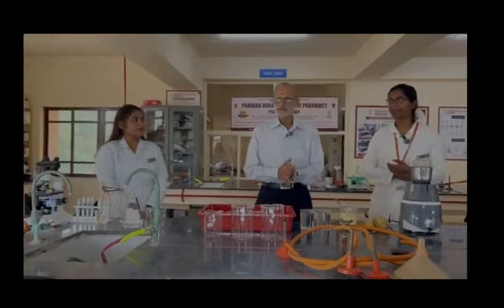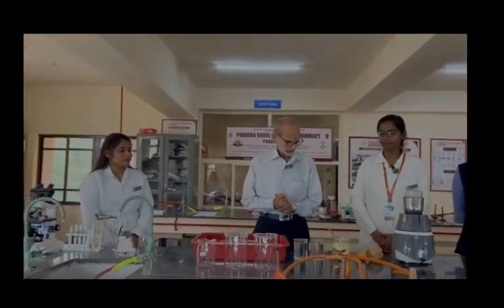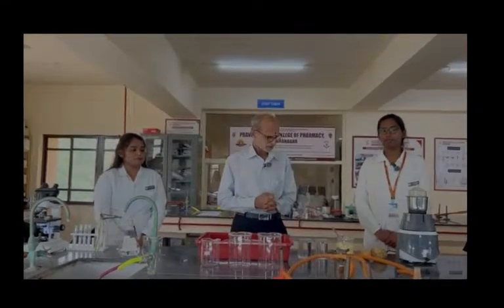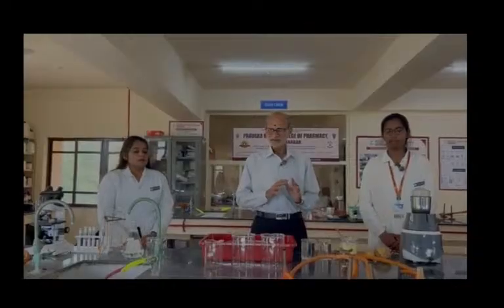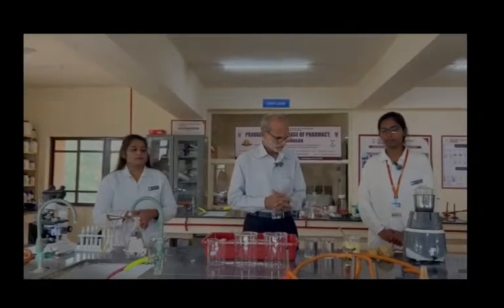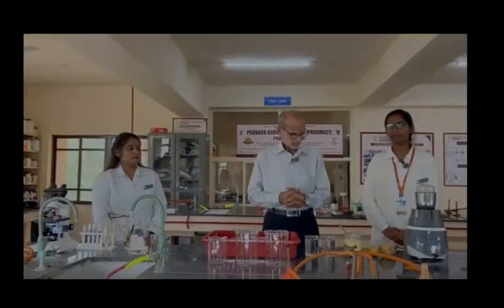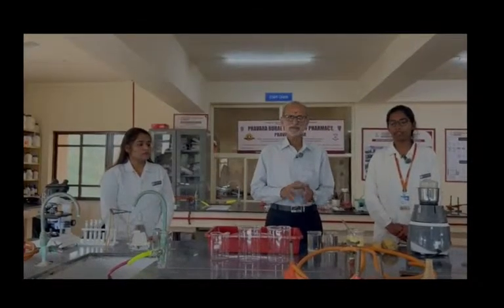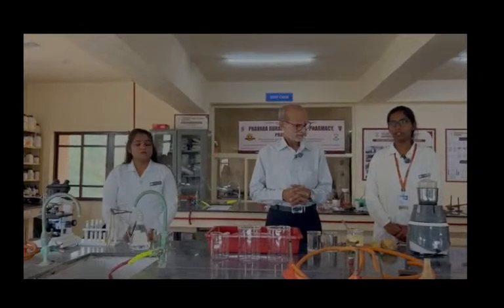We are going to begin with the very first experiment, that is separation of starch from potato. Let me give some idea about the starch. Starch is extensively used in the industry, whether it is food industry, pharmaceutical industry, or textile industry, or the paper industry. So starch really has good importance in the society, and we are going to begin. There are three important starches. Number one, and most widely used starch, is a cornstarch. Number two is a potato starch.